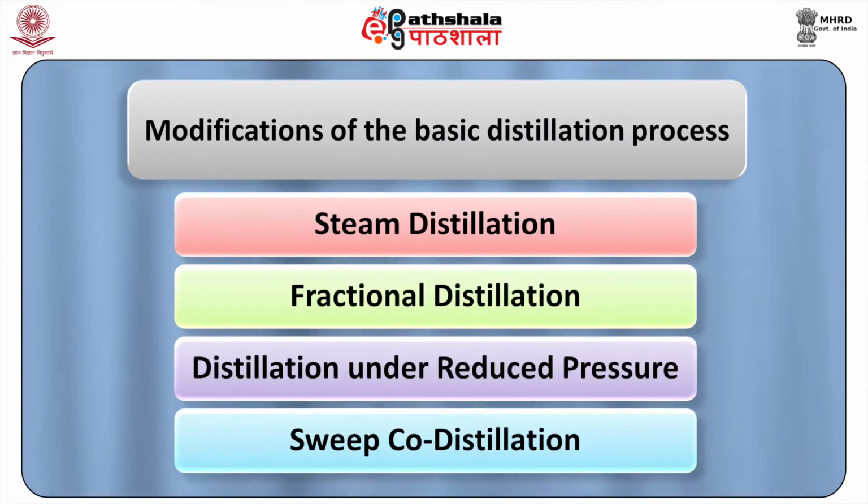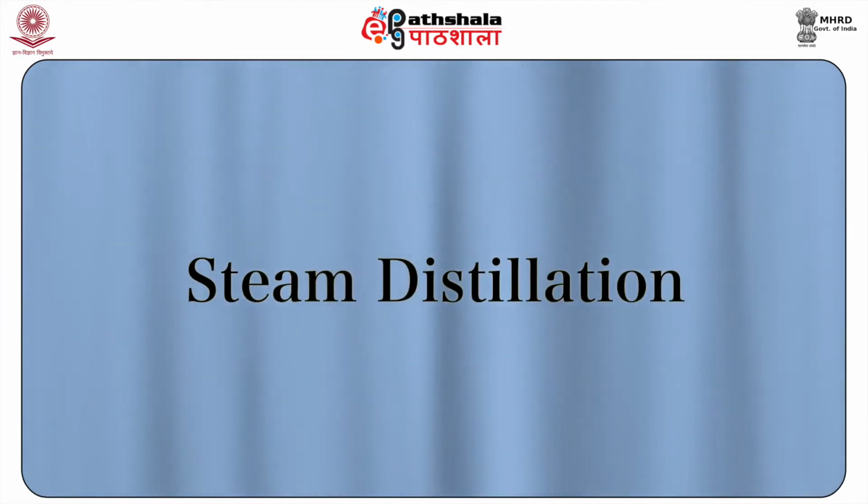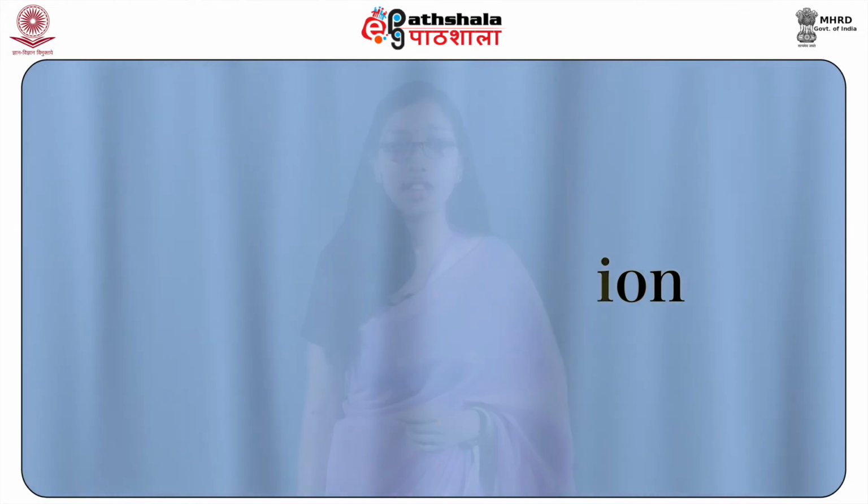Various modifications of the basic distillation process are used for a specific purpose, that is steam distillation, fractional distillation, distillation under reduced pressure, sweep co-distillation, etc. Let us now study about steam distillation.